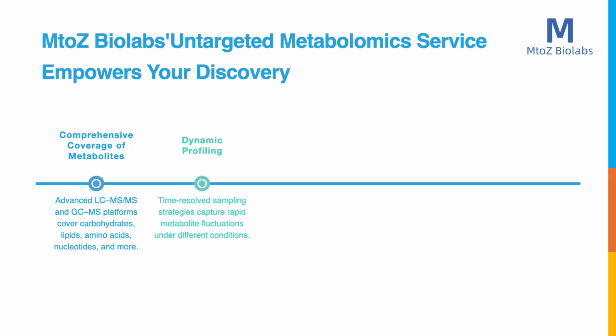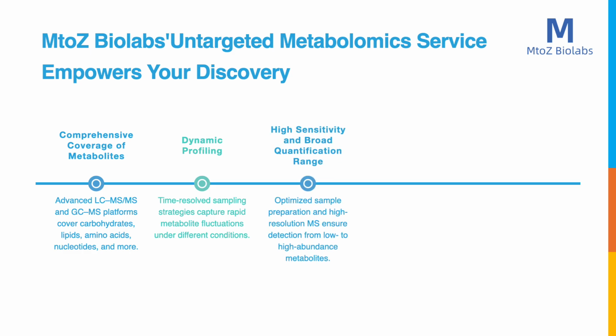Time-resolved sampling and optimized preservation protocols capture rapid metabolic fluctuations influenced by environment, diet, or disease. High-resolution instruments with extended dynamic range, combined with optimized sample preparation, allow reliable detection of both abundant and trace metabolites.